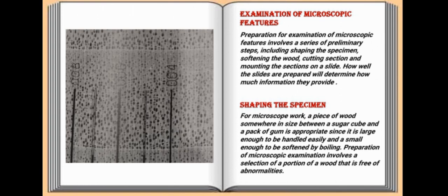The examination of microscopic features involves the study of very small structures that are not visible to the naked eye, typically at the cellular or subcellular level. This process is commonly conducted using microscopes such as the light microscope or the electron microscope and other specialized tools.